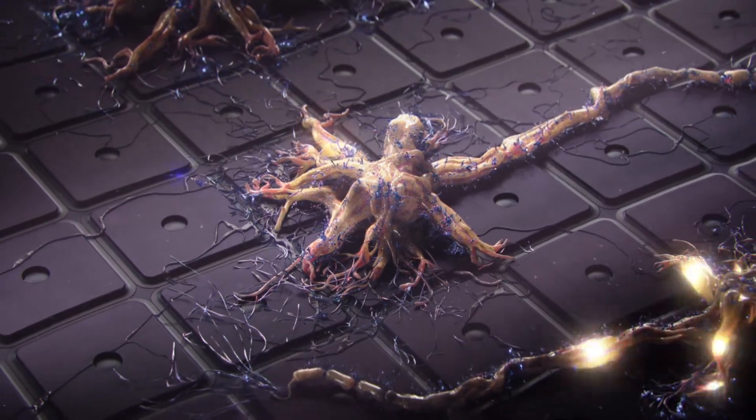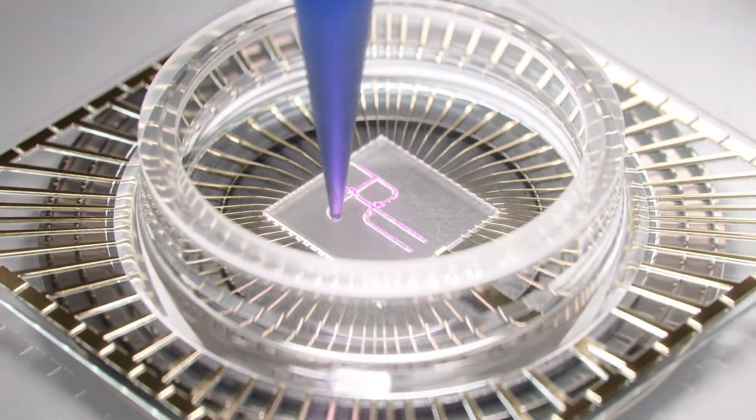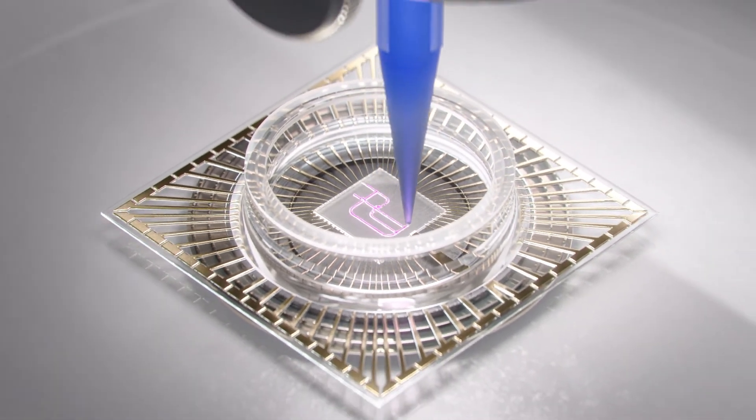The Bio X6 opens an incredible array of possibilities, such as printing tissue with embedded electronics, and new applications are growing all the time.